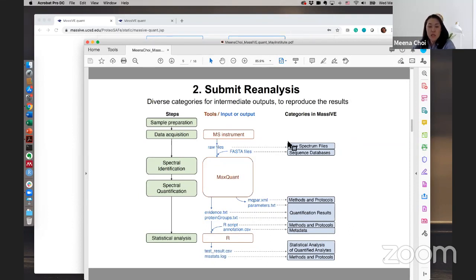However, most data sets have only raw files. The intermediates are really hard to find. Even the experiment design, we cannot find what exactly it looks like. Then we actually cannot reproduce all the workflow. So let's say we have a raw file. We can run everything, using any kind of data processing.